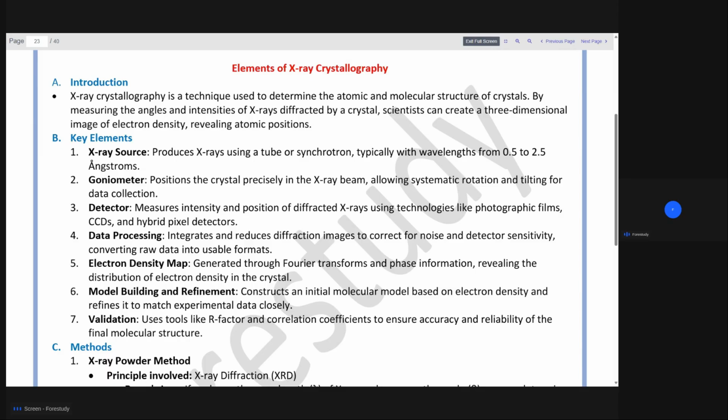The same way X-ray is done in crystallography to understand the internal structure, every chemical element present, every chemical compound present, how the mineral structure is from the micro scale level, the crystal structure, the different phases, the crystallographic orientations. Everything we can understand using this X-ray technique.